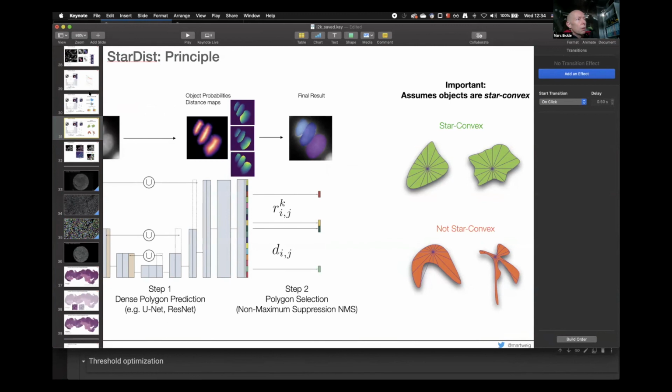Yes, that's a very, very nice idea, and that actually should work in principle. The only problem is that it's kind of tricky to understand when things are separate objects that just happen to be close and when they actually belong together. That is the main core, right? If you just want to stitch things together, it's not clear how to get the information that they should not be two objects, but one, so it should be fused and one not.